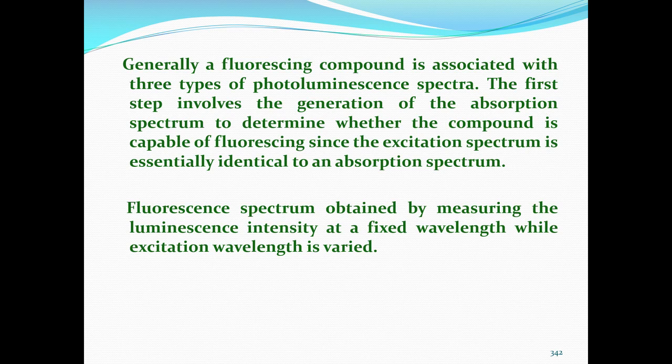So, the second point is, if the compound is capable of absorbing, then the excitation spectrum is essentially identical to an absorption spectrum also.